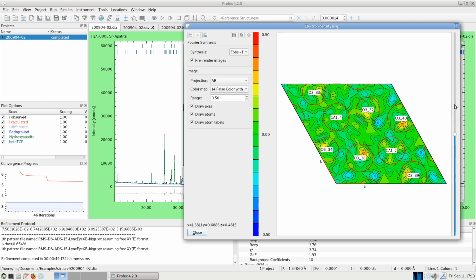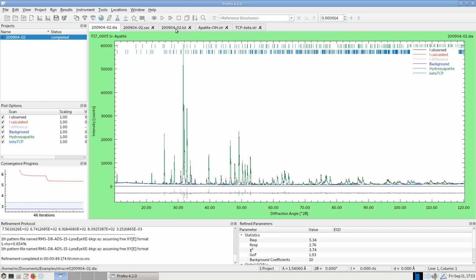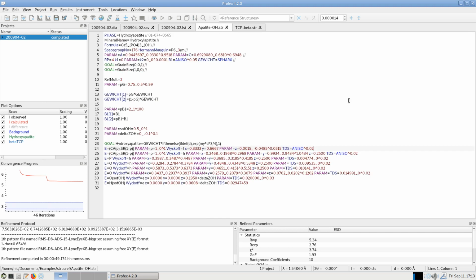Not much of an improvement, so they don't seem to be really anisotropic. And I think that's about all we can do. I have no idea what to change. And all in all, the map looks pretty okay.